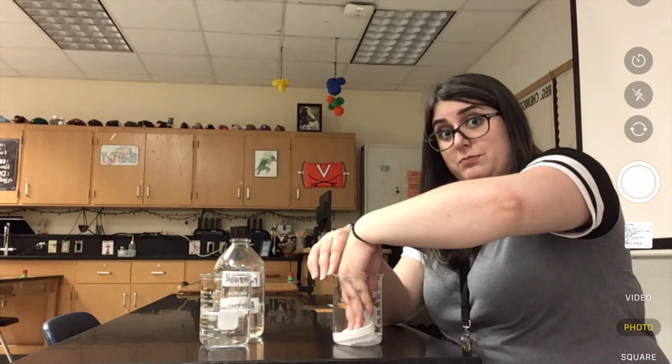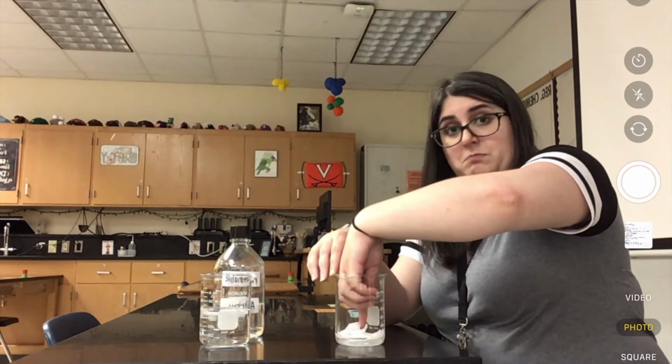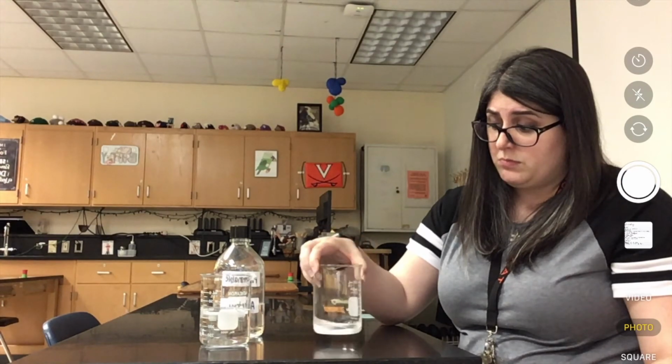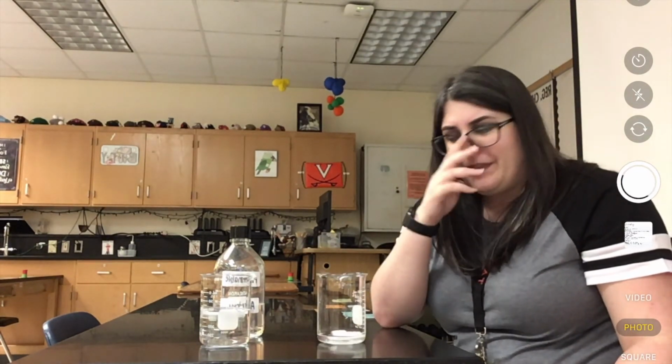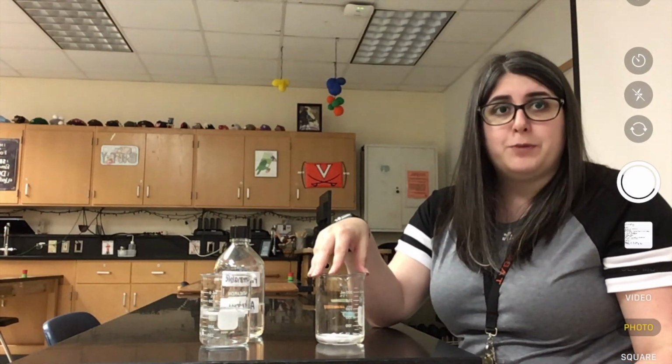Wow. There's no styrofoam cup anymore, right? The acetone very much dissolved this styrofoam. The styrofoam was nonpolar, so that tells us the acetone was also nonpolar. Like dissolved like.